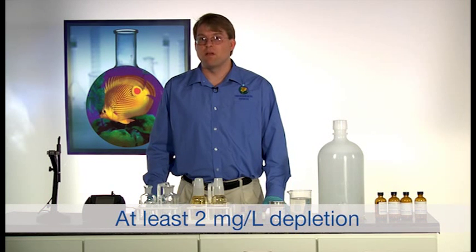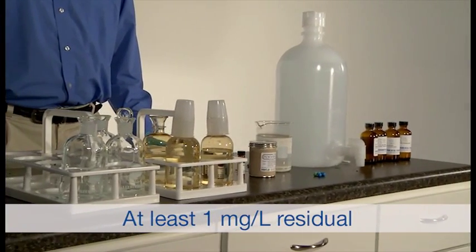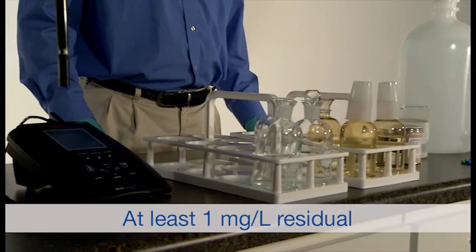In order for a sample to be acceptable, it must have a minimum of two milligrams of oxygen per liter depletion and a residual of at least one milligram of oxygen per liter remaining. This is known as the two to one rule.